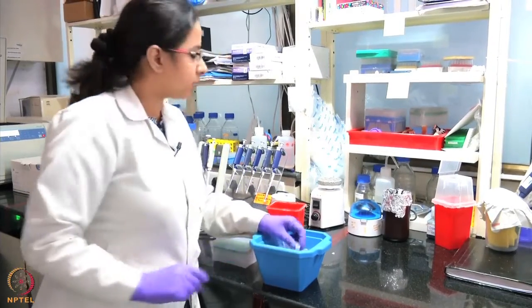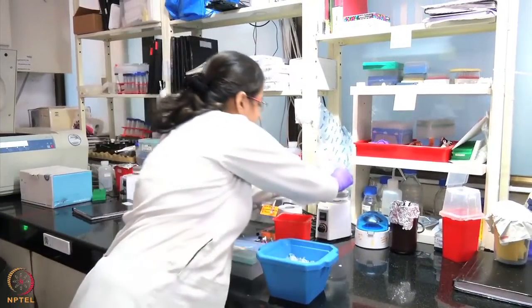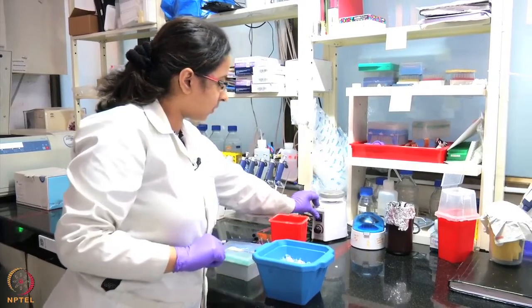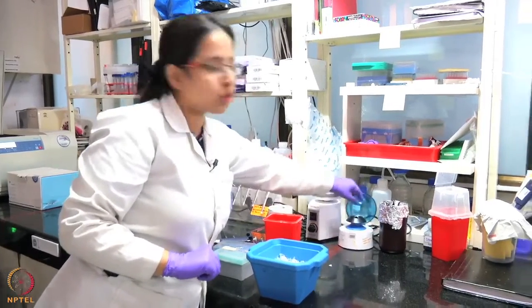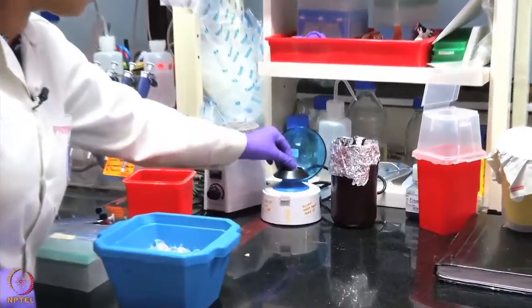I'm going to vortex the tube so that the components are mixed properly. Then I'm going to give them a short spin so that whatever has stuck to the walls will come down.